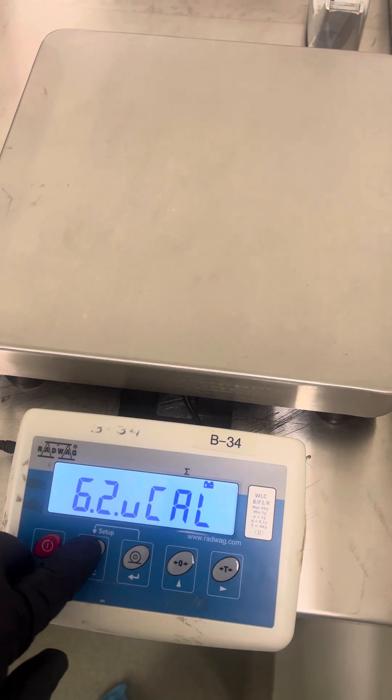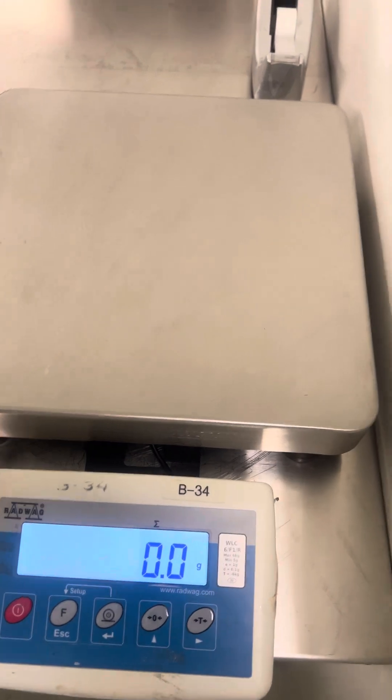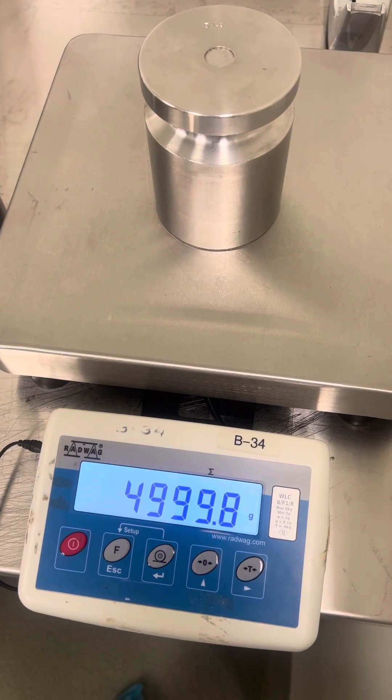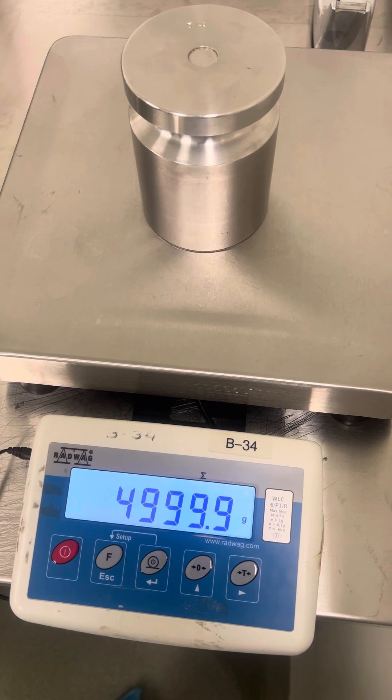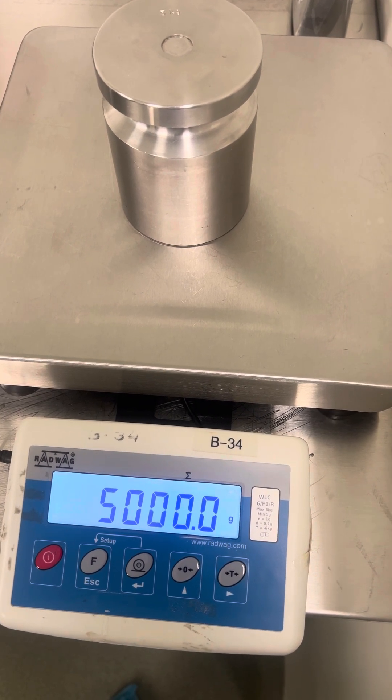Once it goes to that, you press escape, escape, save, enter. And that is how you adjust the calibration of a Radwag WLC-6.